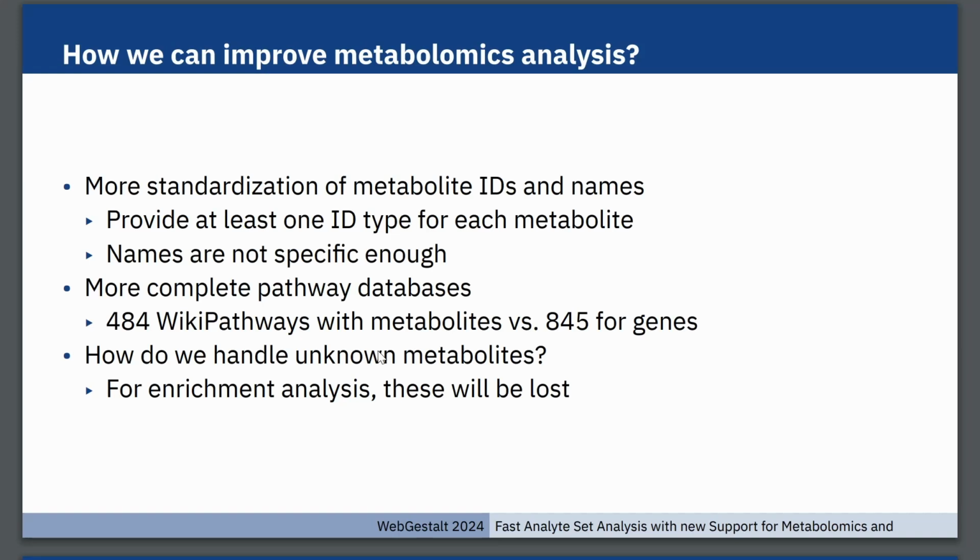So that's something that is identification, but also even if we couldn't directly use the metabolite name, we can still maybe identify, this metabolite is probably related to this pathway or is part of this chemical class, and then we can go on from there. So I think there's a lot of work that we can do with these unknown metabolites.